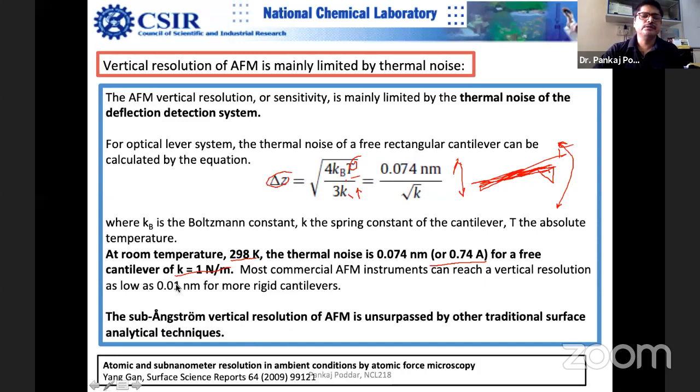If you compare this amount with, for example, the thickness of graphene, you can see that in comparison, the diameter of a hydrogen atom is 1 angstrom. So I think it is very good. If you would like to measure the diameter of a hydrogen atom, and you can measure it as 1 angstrom plus or minus 0.1 angstrom, then you're happy with that.